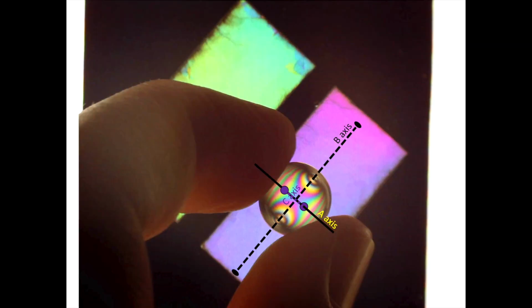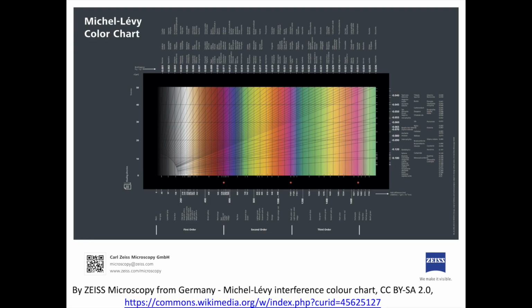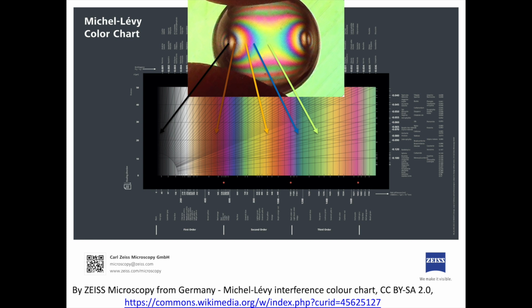Now that we understood the orientation of our Muscovite plates, we focused a bit more on interference colors and the Michel-Lévy Color Chart. We figured out the path difference for the interference color shown by each of our oriented Muscovite plates, and how the almost BXA interference figures can help us figure out the order of our interference color. The unique experiments today really revolved around how our oriented Muscovite mica plates interact with one another.